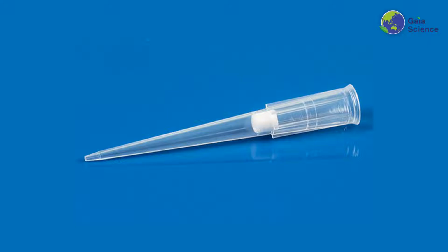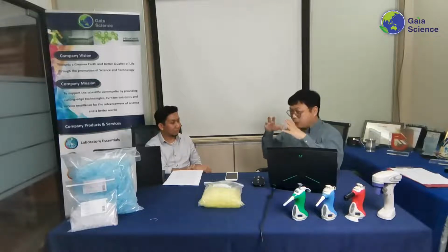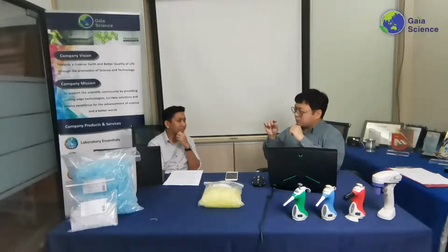Okay, so actually, I was reading around. Firstly, you can't autoclave filter tips. That's because autoclave requires a part where it's going to be wet. So you can read up a bit online about the process, but basically there's a part where some of your items will get a little bit wet. If you've done autoclaving before, there's a period where it will be full of steam. That steam can go to any part that has been exposed, including the filter as well. So the filter, if it's wet, then basically that's it, you cannot use it. Which is why normally you don't autoclave filtered tips.